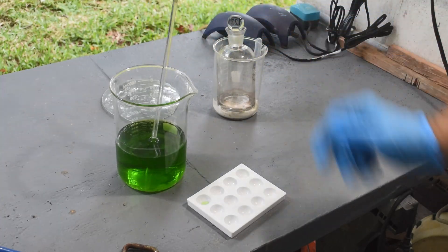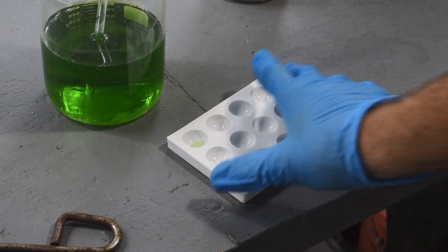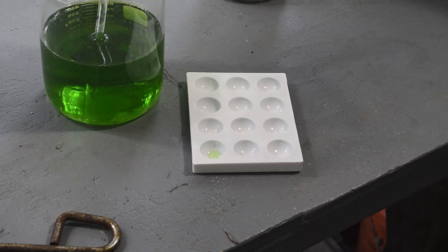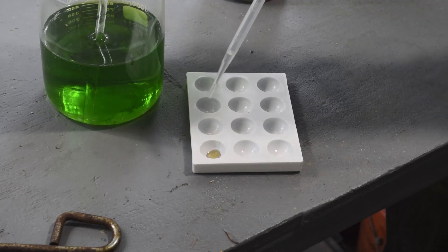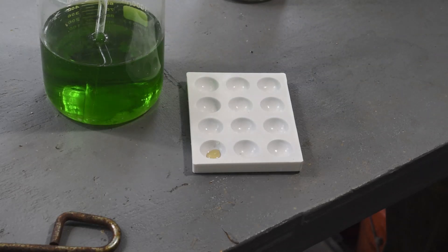Let me zoom in on the spot plate for you so hopefully you can see the reaction when I put the stannous chloride on it. Well — yes — I would say there is still palladium in there. Is it enough to worry about going after? That's the question. It certainly looks like a weaker indication than what we were getting before, but there is still palladium there.